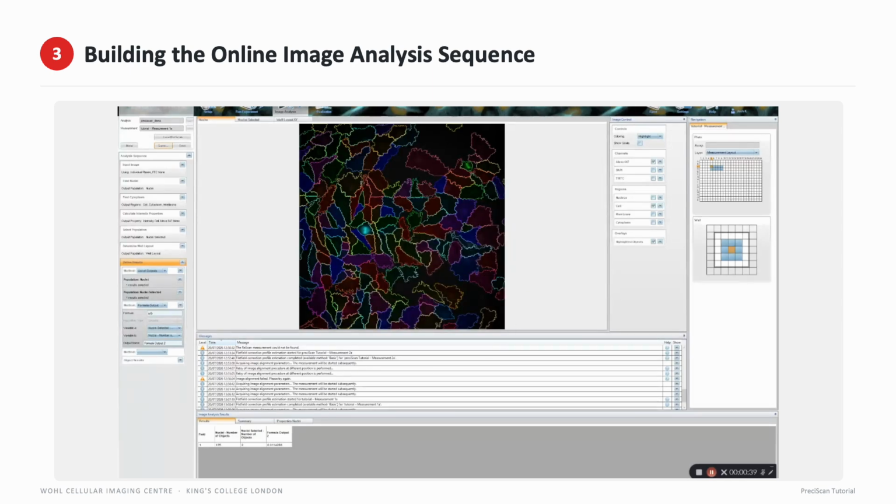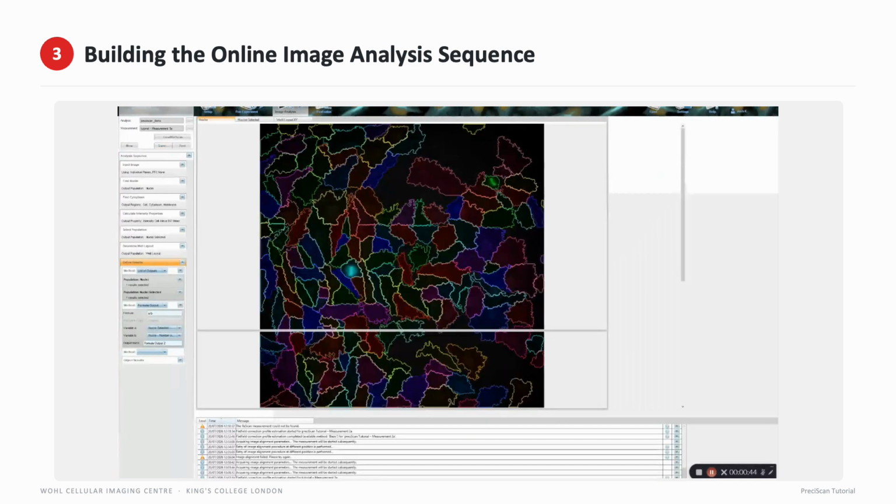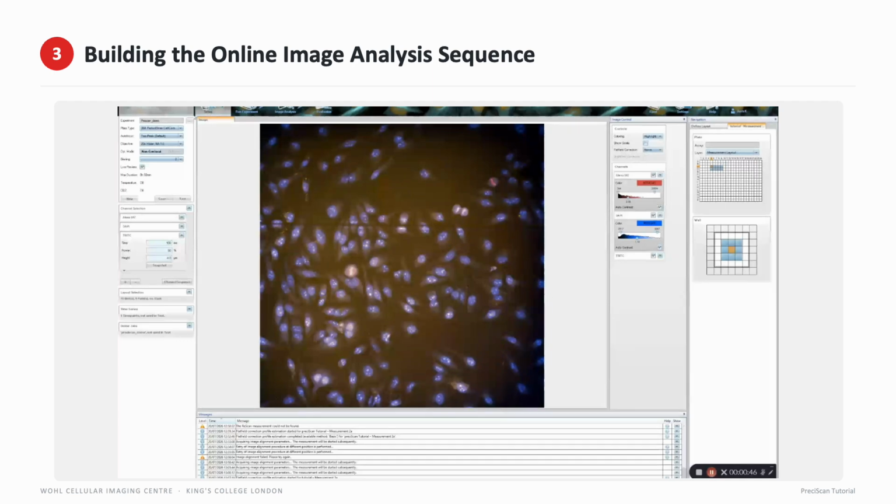You don't necessarily need this result, but for some reason, the PreciScan seems to crash without it. Whereas every time I've run it with this formula result calculated, it's run smoothly without falling apart at any point. So I would recommend that you include it in.